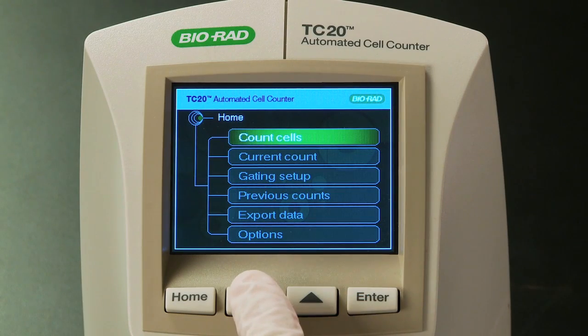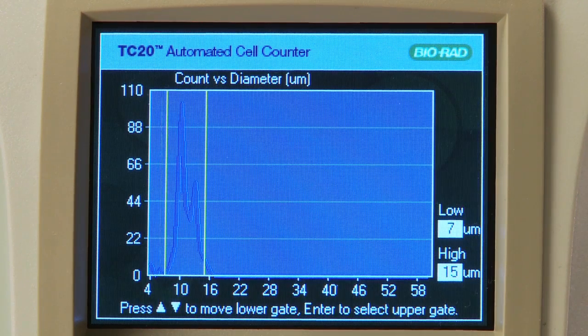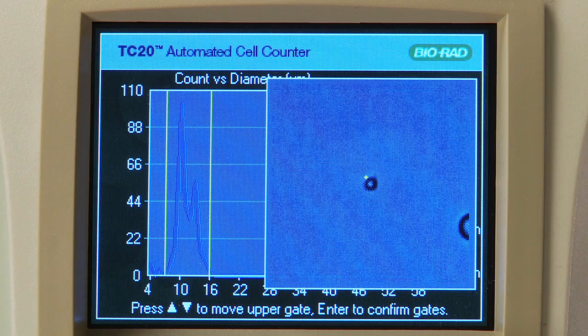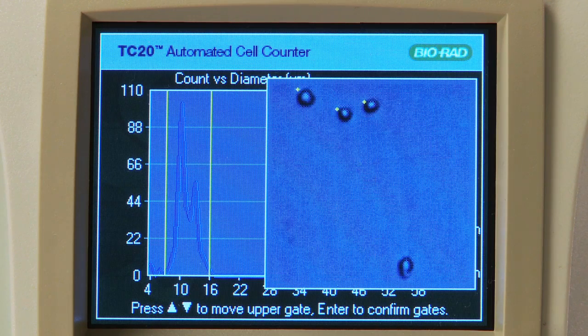For more complex samples, such as primary cells, you can turn on the user-defined counting mode and select the cells to be counted by adjusting the position of cell size gates. If you frequently work with similar samples, the TC20 can save you time by remembering the position of the gates.